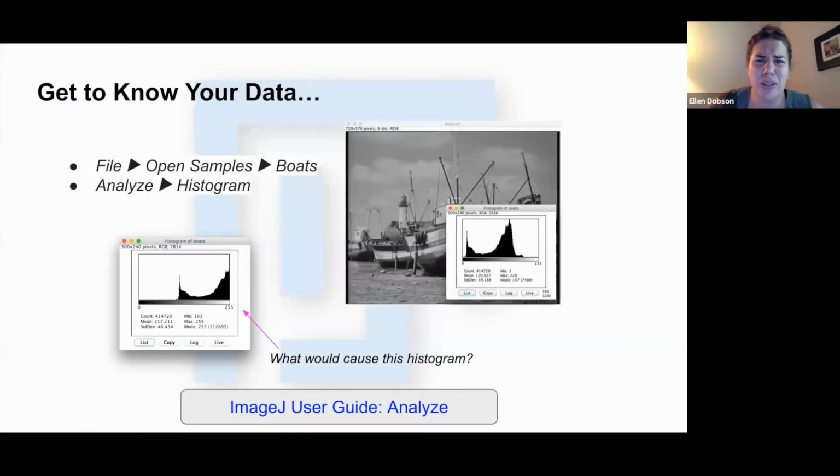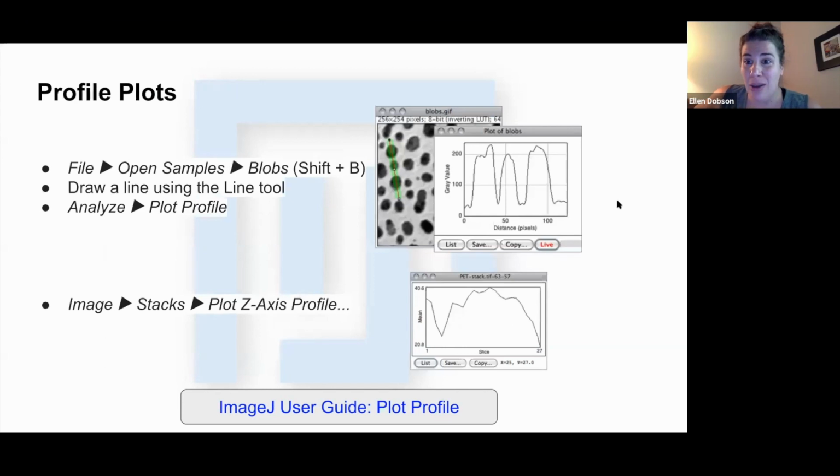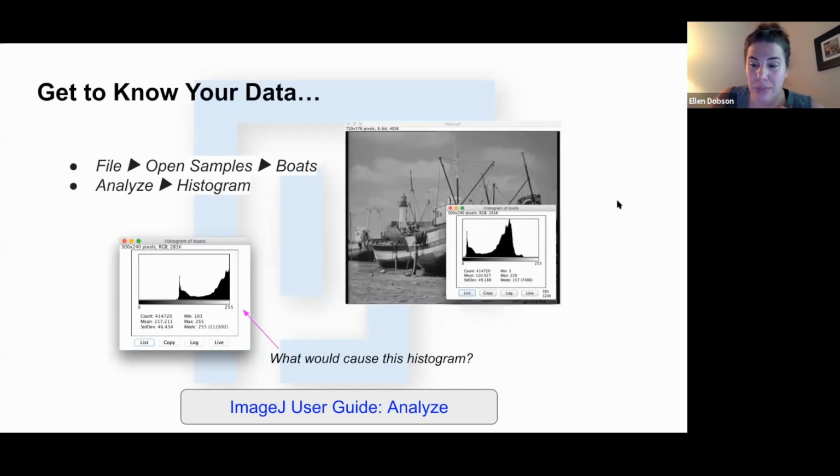Are there any questions yet? I see some chats popping up. There's an installation issue that I'm chatting with someone about. Do you need any assistance, or is it good? I think I found a solution, but I can ask real quick just in case. On a Mac, someone is having an error saying that Fiji is read-only, so they can't update anything.